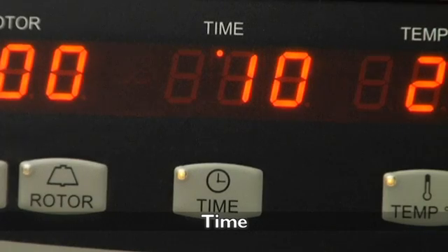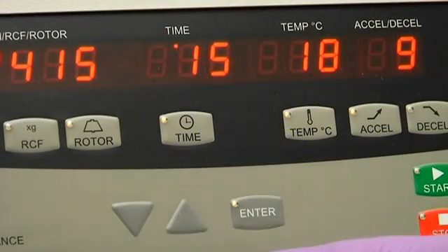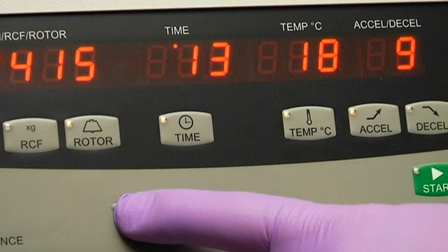Set the time for your run with the simple press of a button. The X30 can perform timed runs of up to 9 hours and 59 minutes.